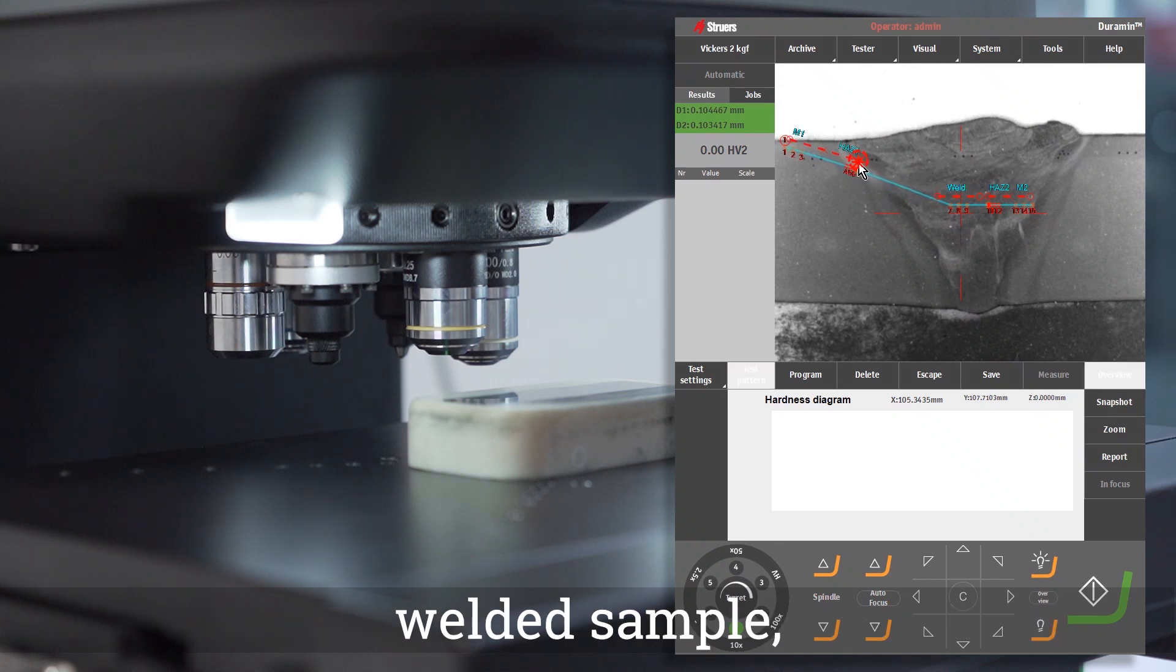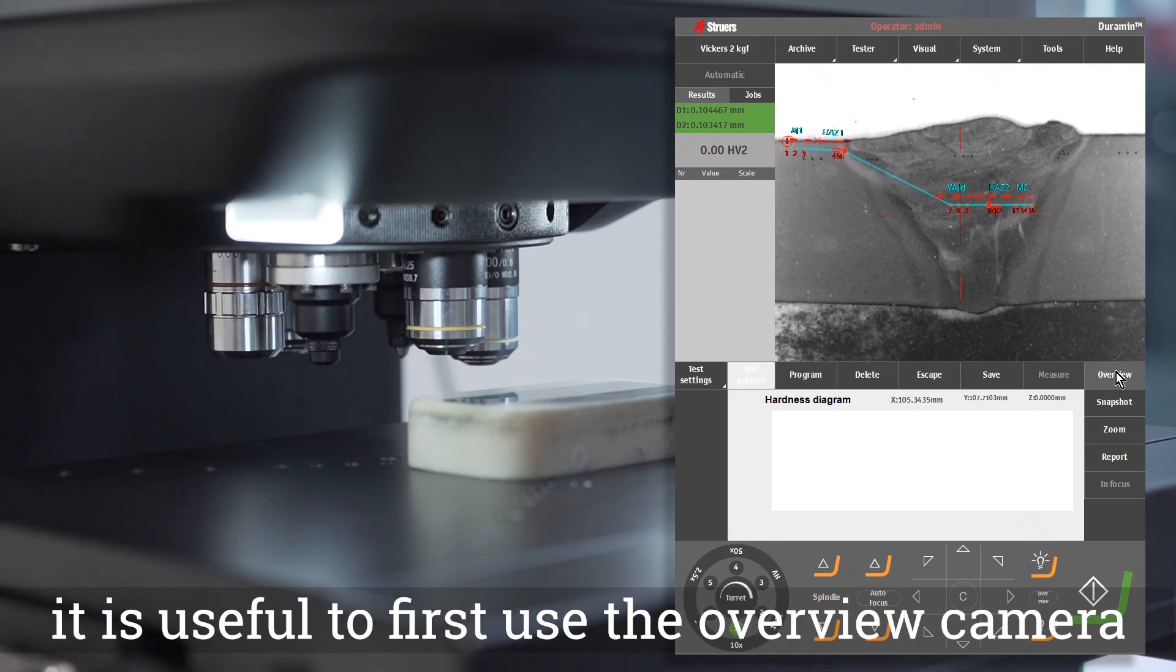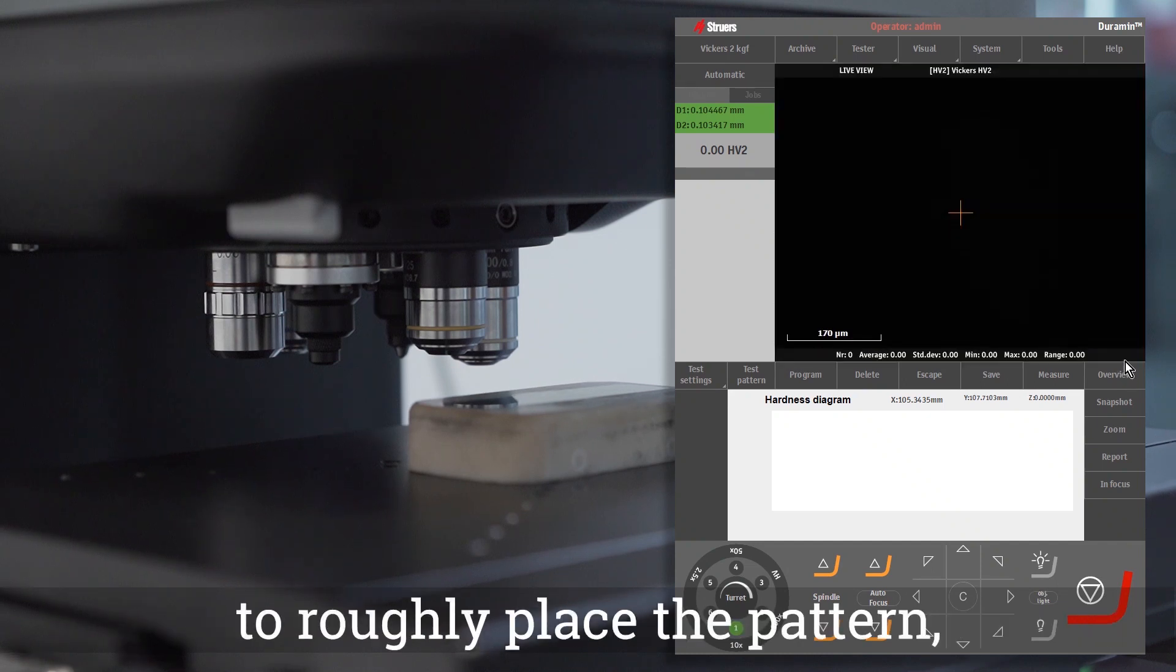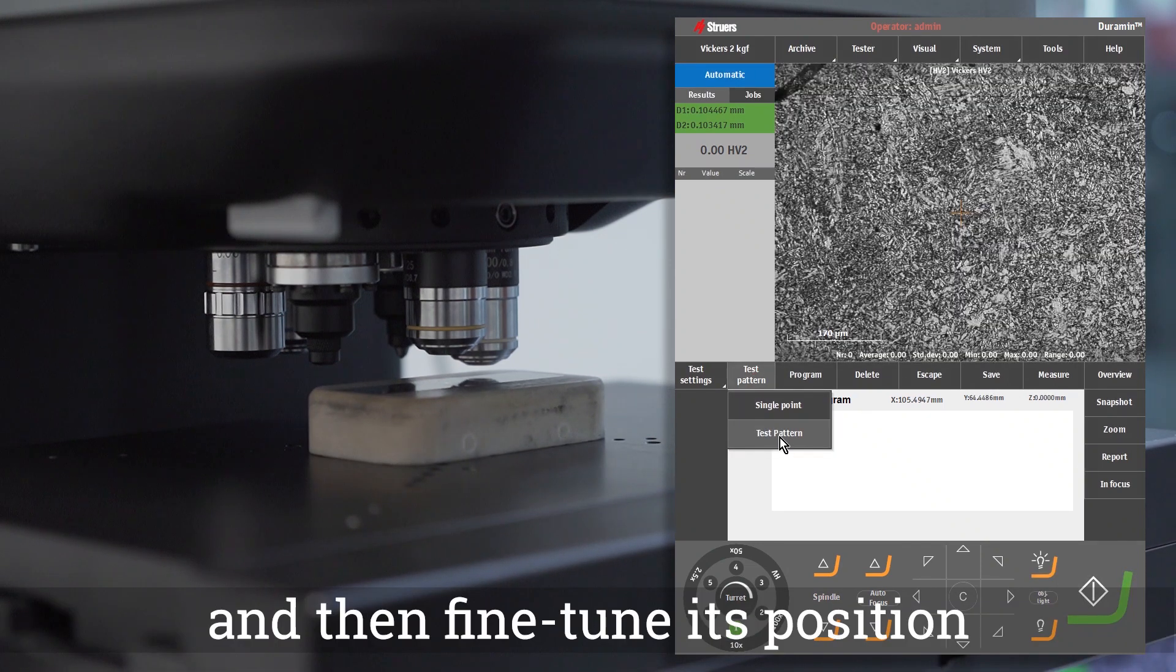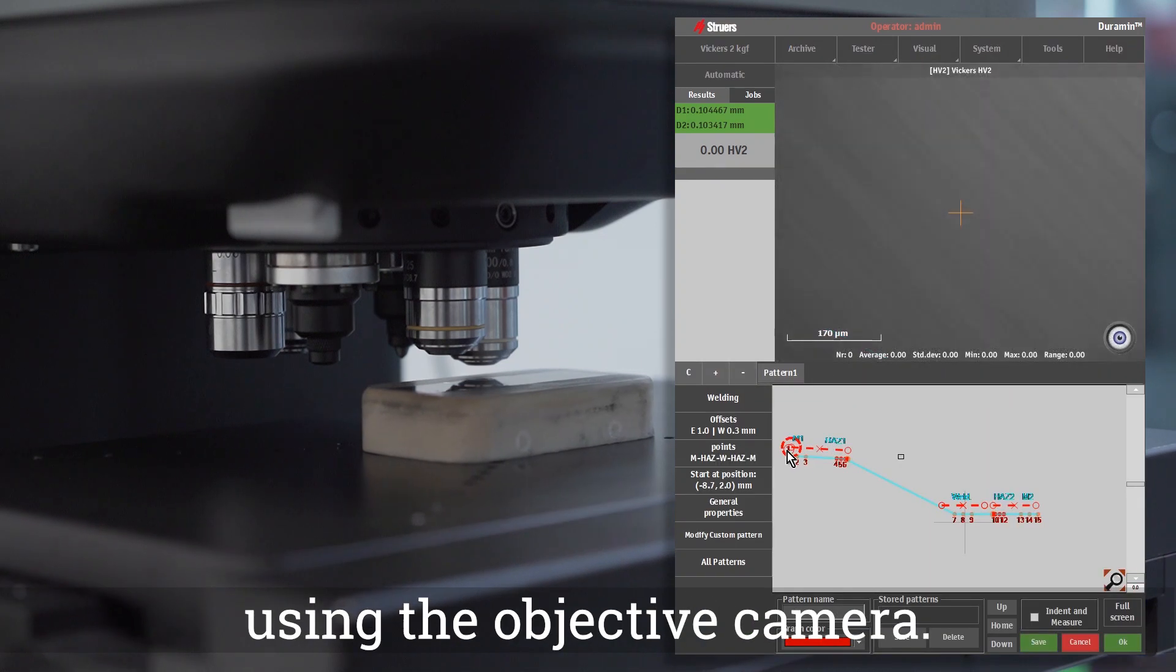For example, when working on a large welded sample, it is useful to first use the overview camera to roughly place the pattern, and then fine-tune its position using the objective camera.